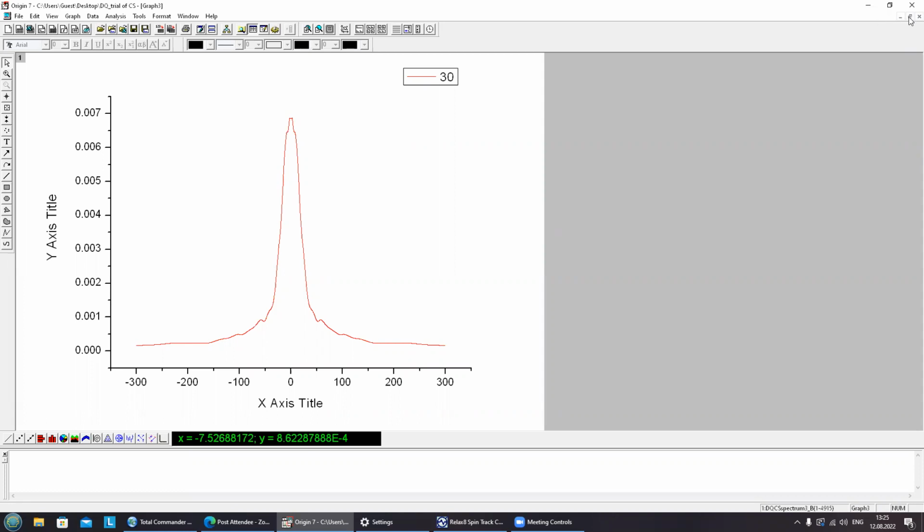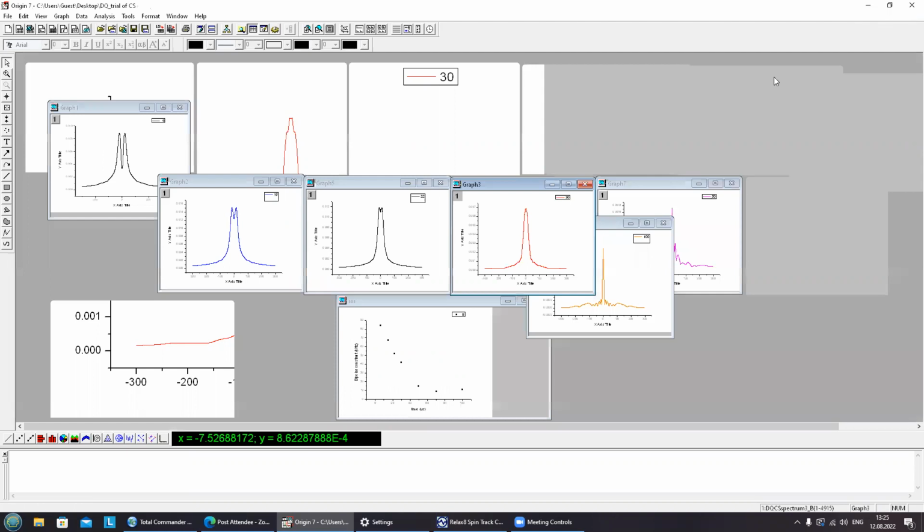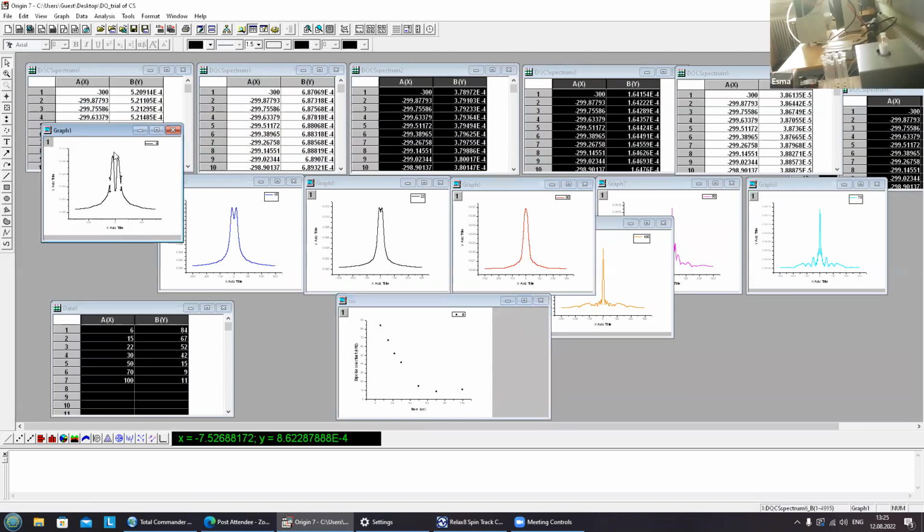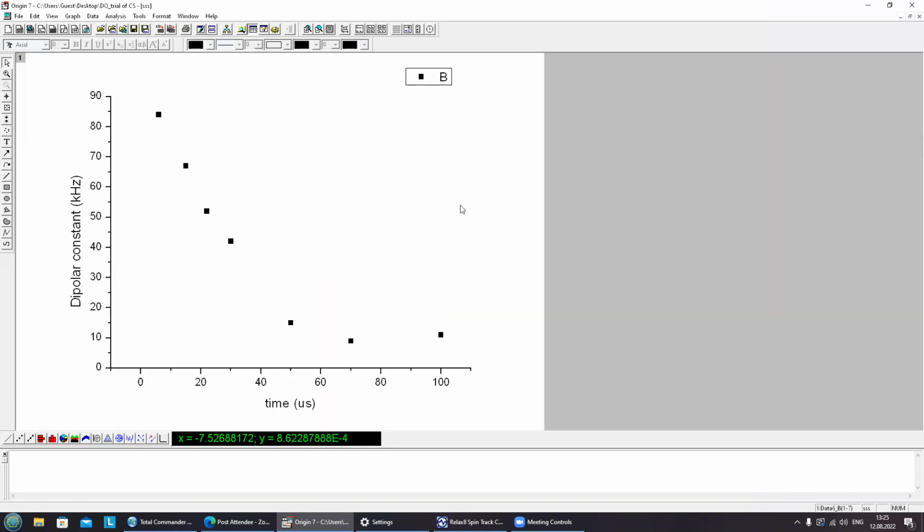And also you can show the graph that you obtained with the dipolar filter. I mean the dependence of this. Changing the time of excitation, you see that you can concentrate on different values of the dipolar constant, and the higher the value, the more crystalline the part; the lower the value, the more amorphous the part.